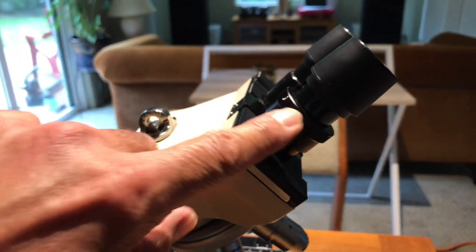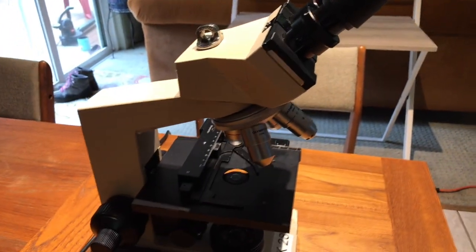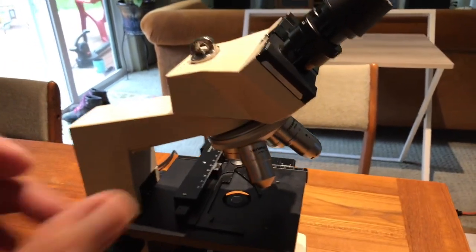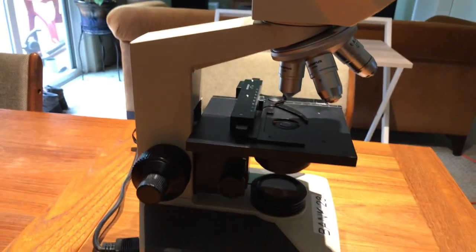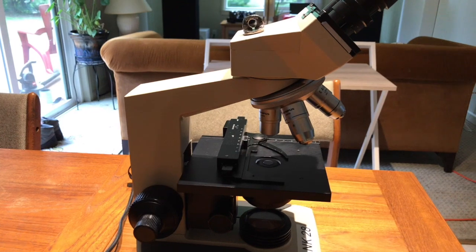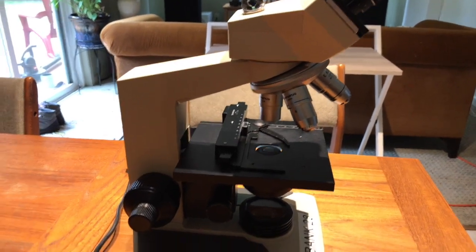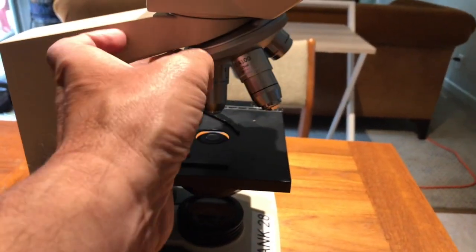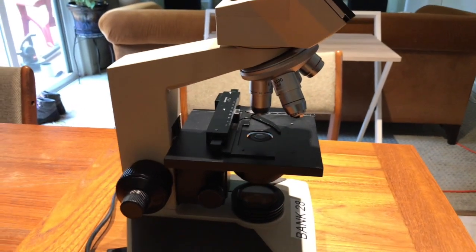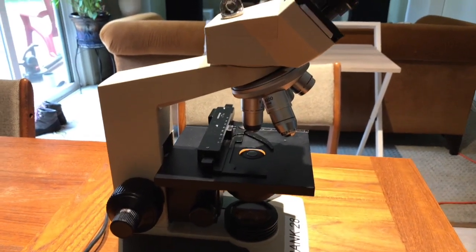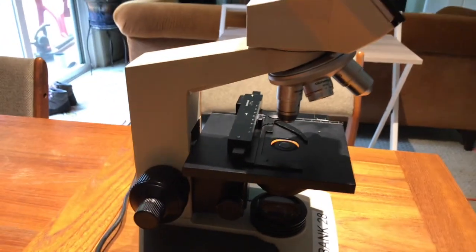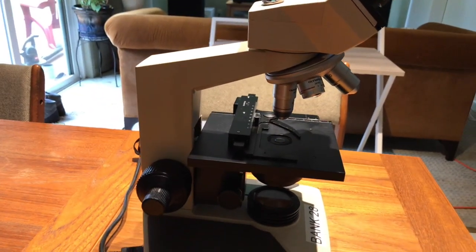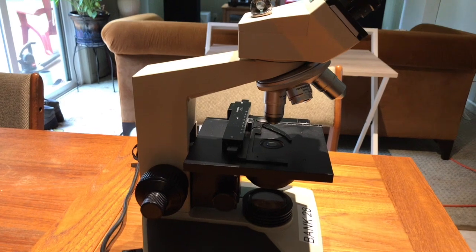If I choose the objective with the 10x magnification, the total magnification will be 100x. And then for the 40, total magnification will be 400. And then with the 100, total magnification will be 1000.